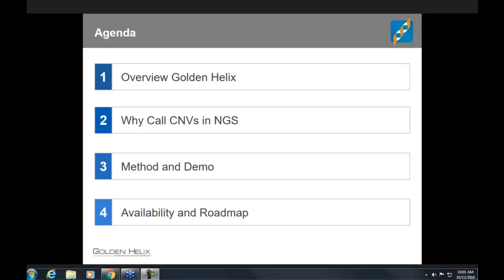We had a fantastic number of people register for this event, so some of you may not have been to a previous webinar, and so I just want to give you a little context there, but also motivate why we are calling CNVs in this type of NGS data, why this particular type of NGS data, how it applies to the clinical workflow, etc.